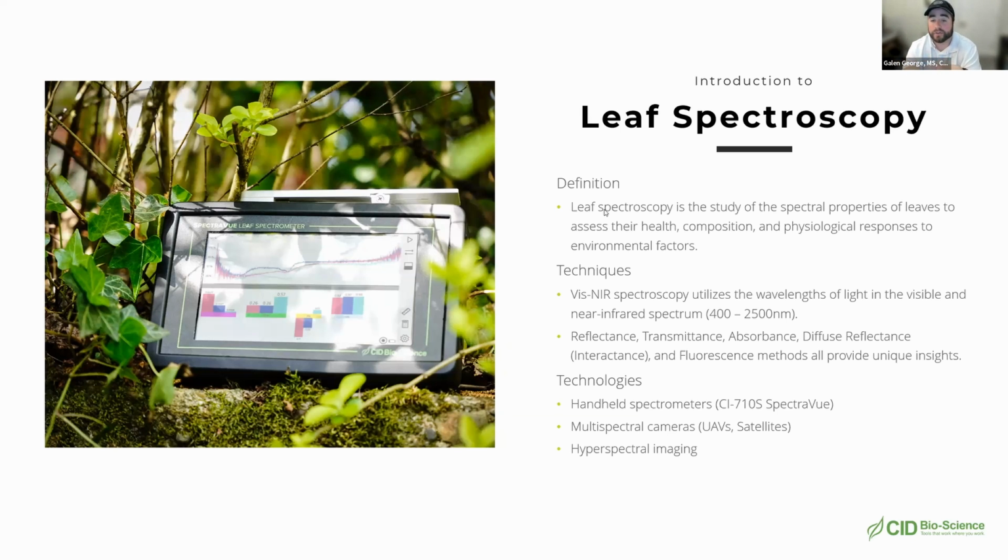Then condensing humidity: we said 0 to 90% non-condensing humidity is our operating condition. If you have condensing humidity and that optical window keeps getting moisture on it, that's going to impact your measurements.